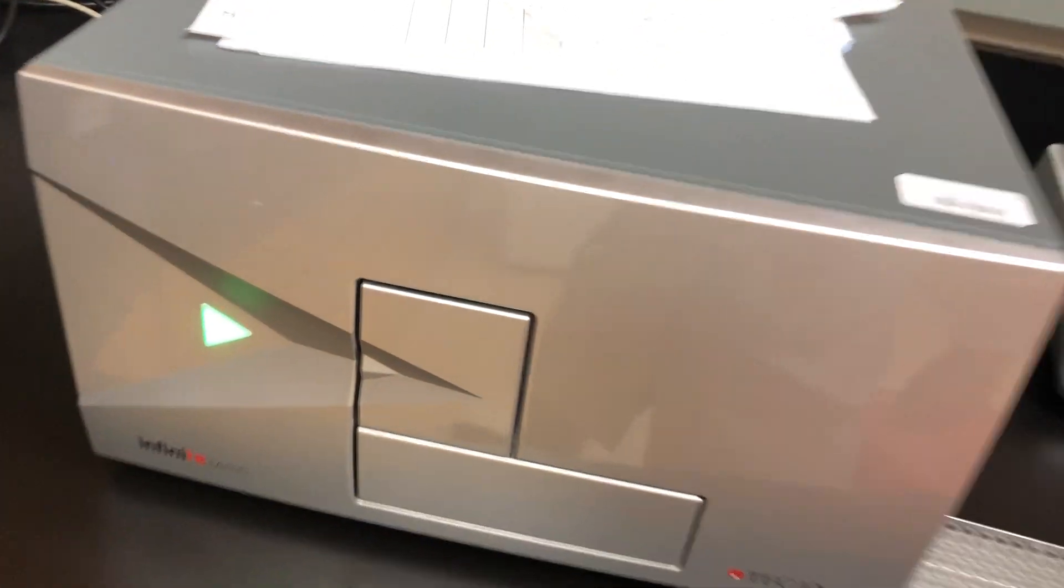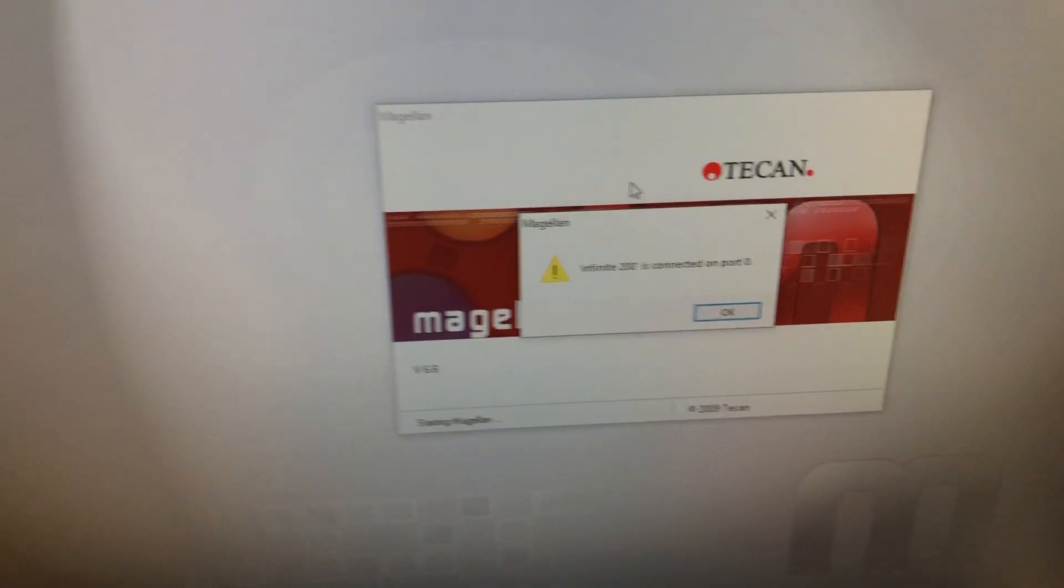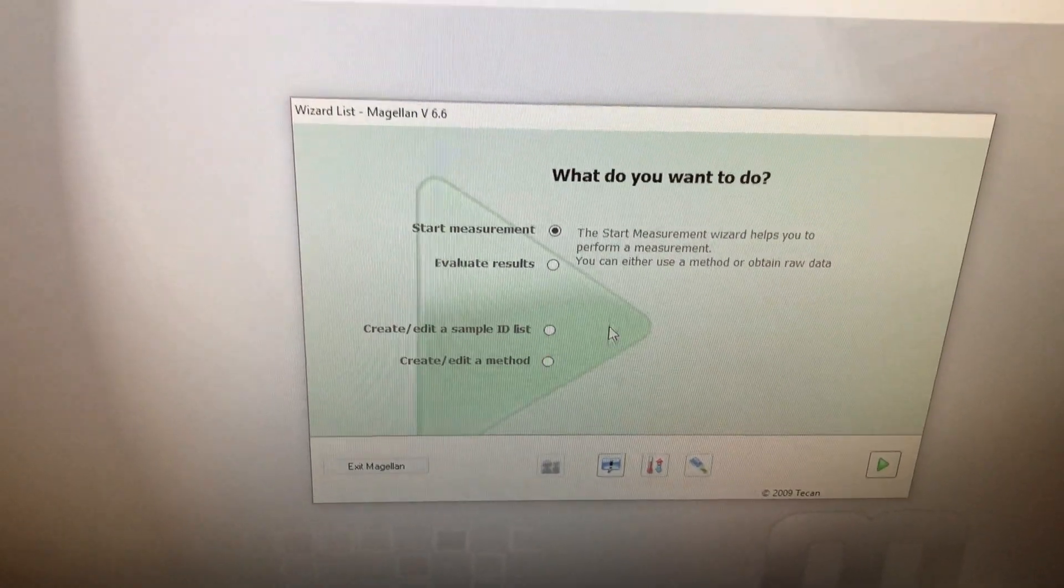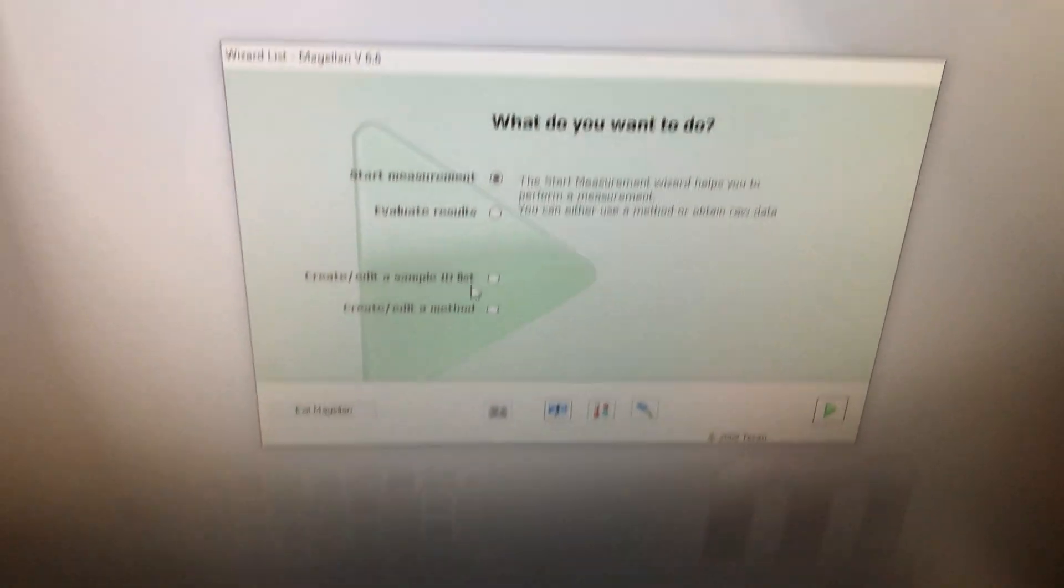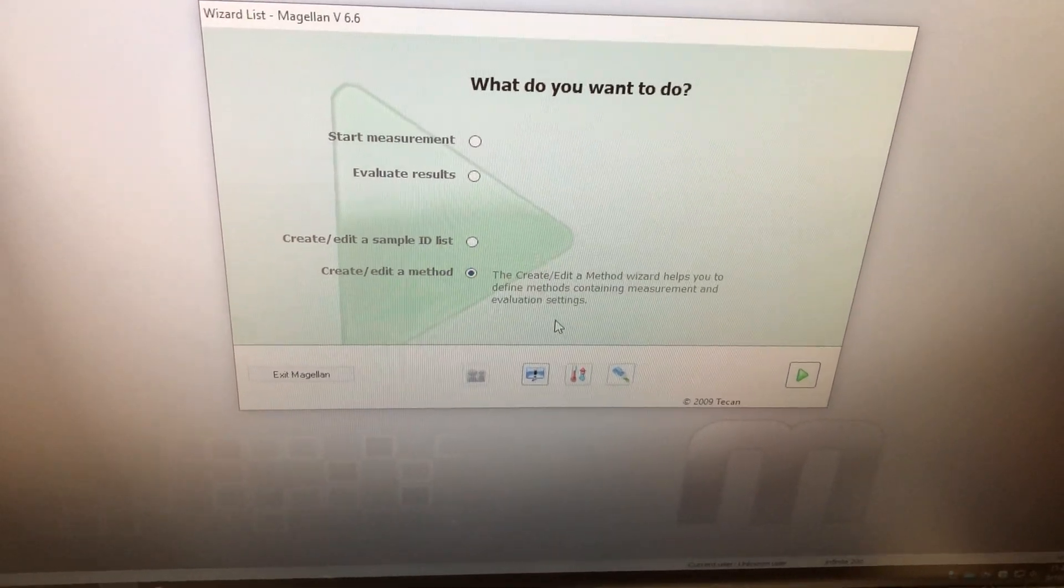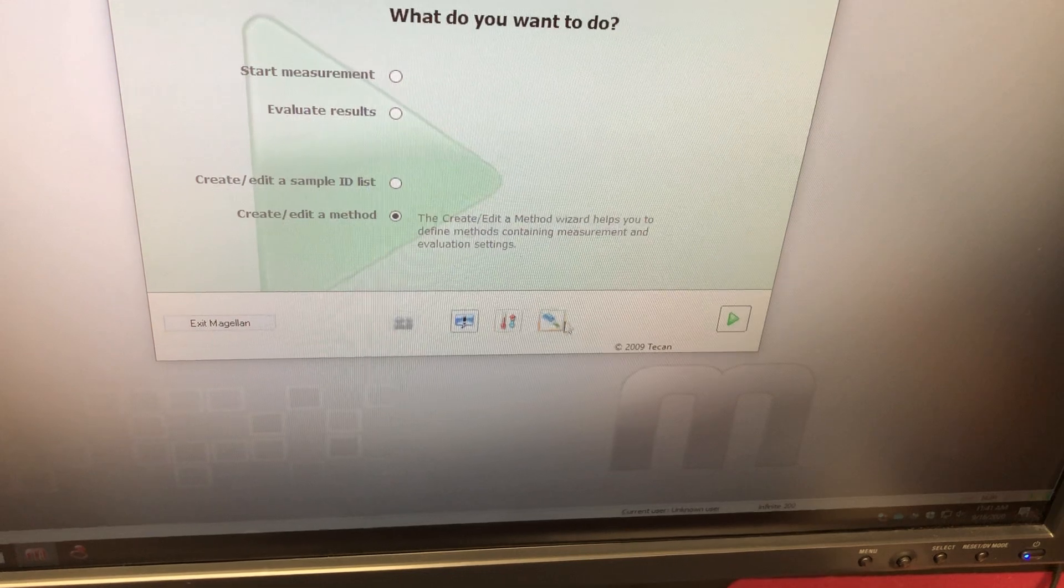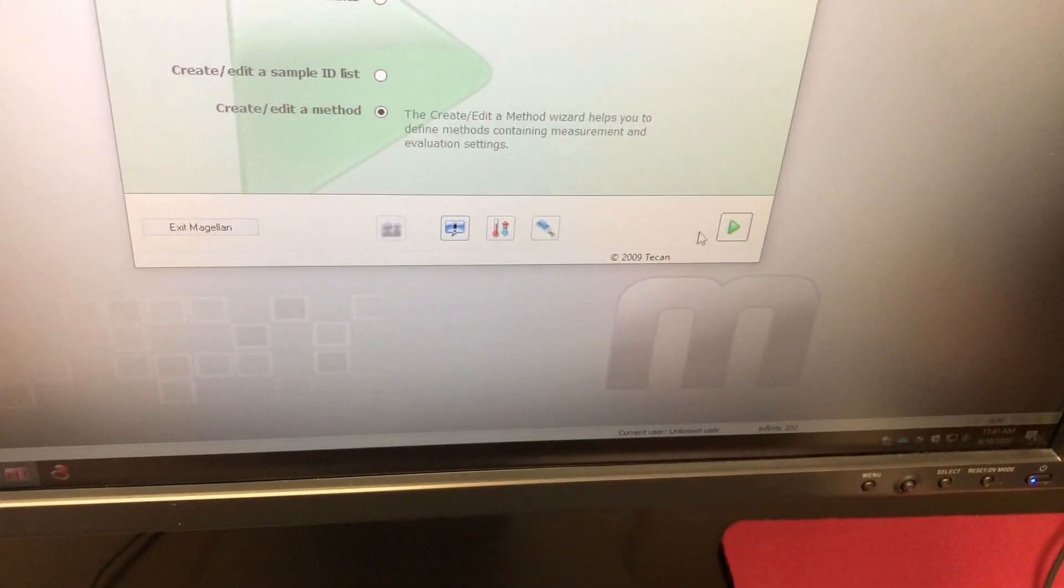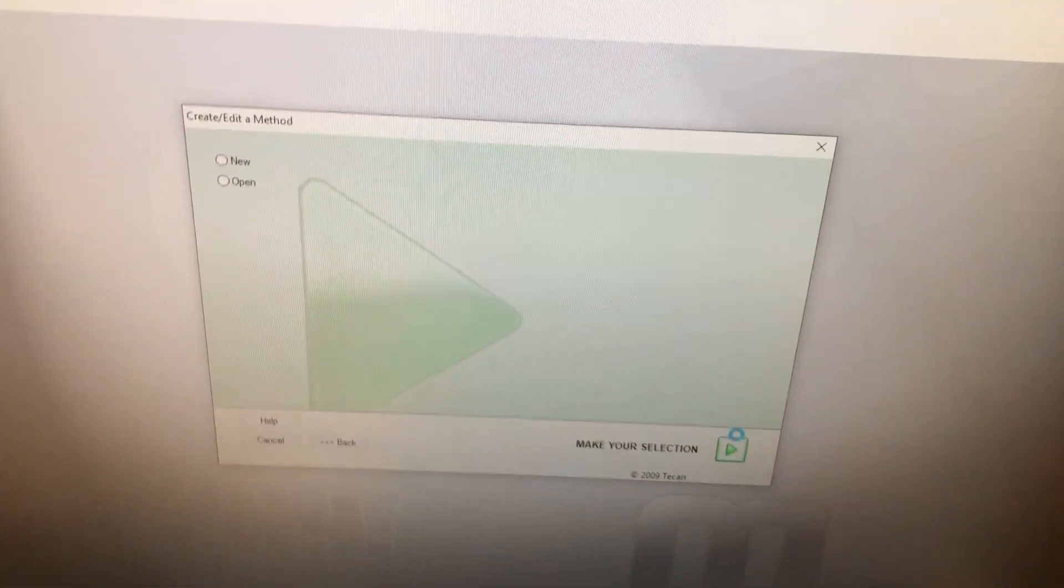But you heard the instrument kind of make a noise. Open up the plate holder. That means it's going. All this is connected. I'll say OK. So you can either just start and run a measurement if you already have an existing protocol set up. If you want to set one up, you can go here to create and edit method. You need to open or close the plate tray here. That's this button. I'm going to go ahead and press the go forward button now that I'm starting to create and edit method.